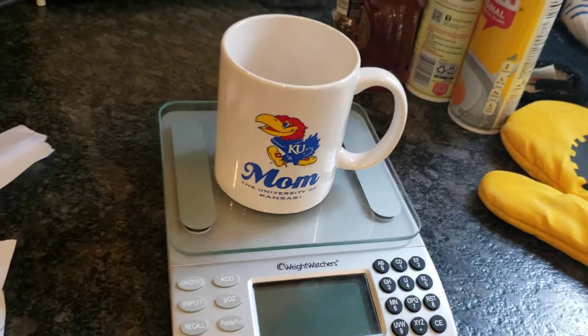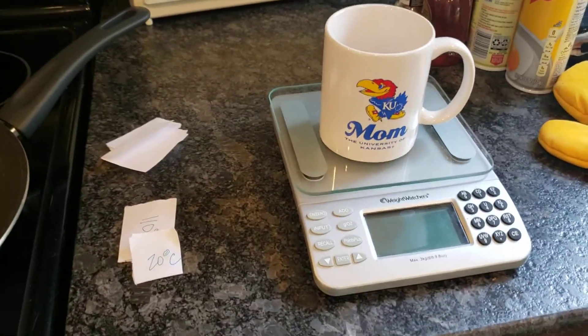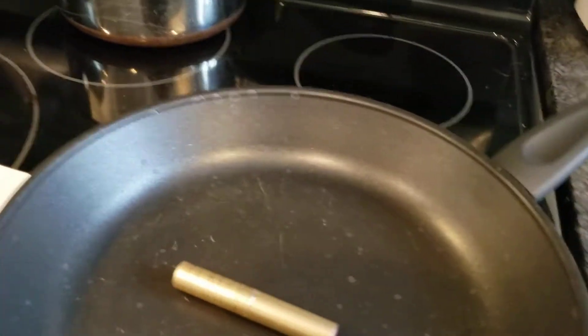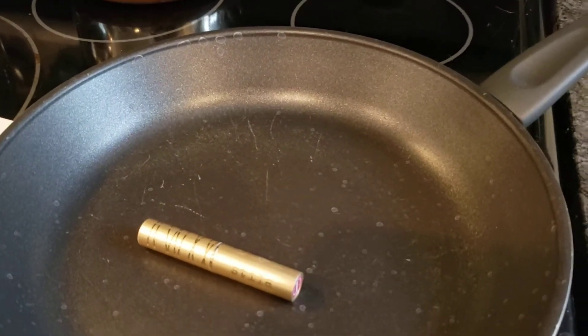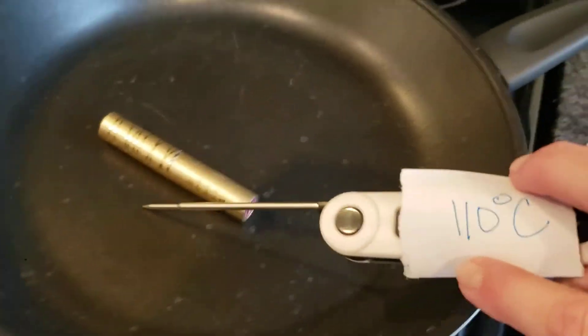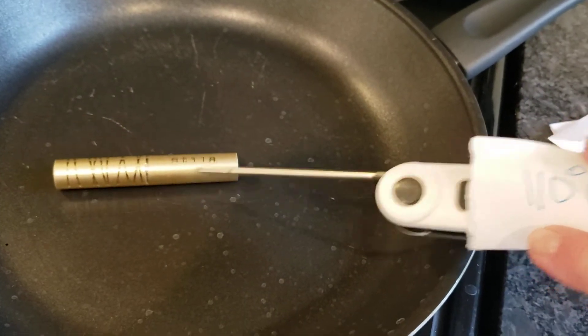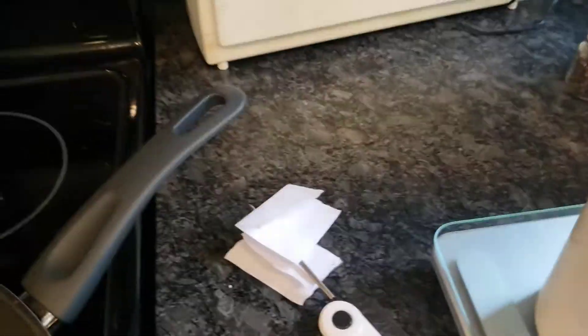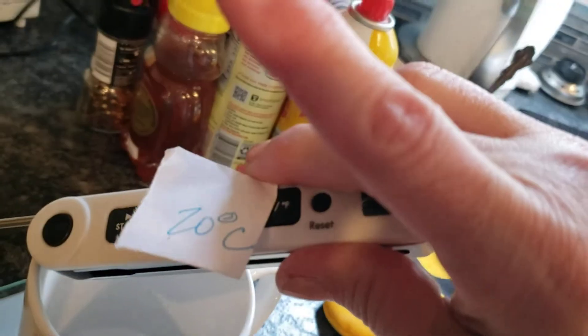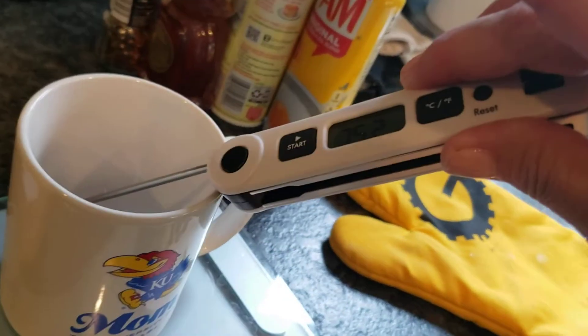Now we're going to take the temperature of our metal. The temperature of our metal is 110 degrees. And we're going to take the temperature of our water — the temperature of the water is 20 degrees.